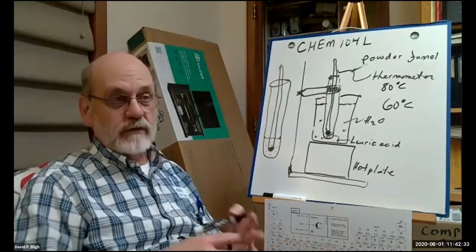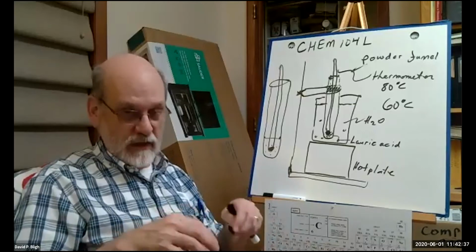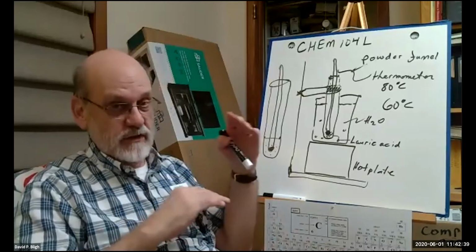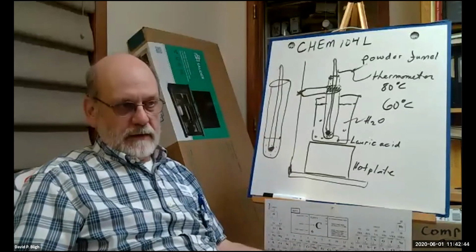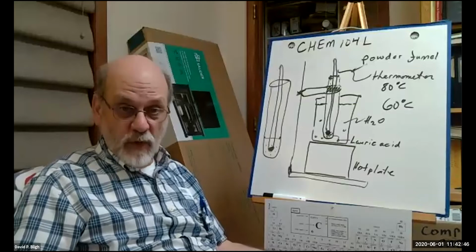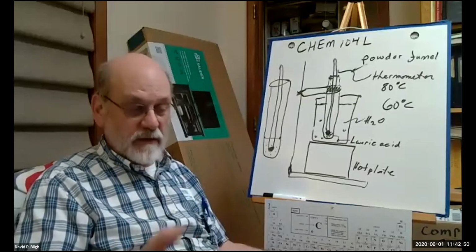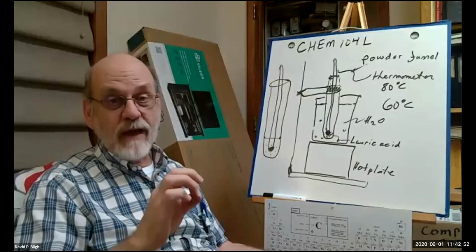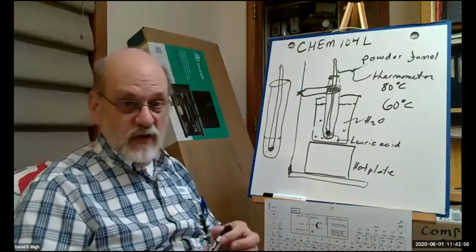Then all you have to do, as far as calculations go, and remember, calculations is a section of your report that I want to see. The calculation after that will be determining the error, right? So you need to know what's the accepted value of benzoic acid.